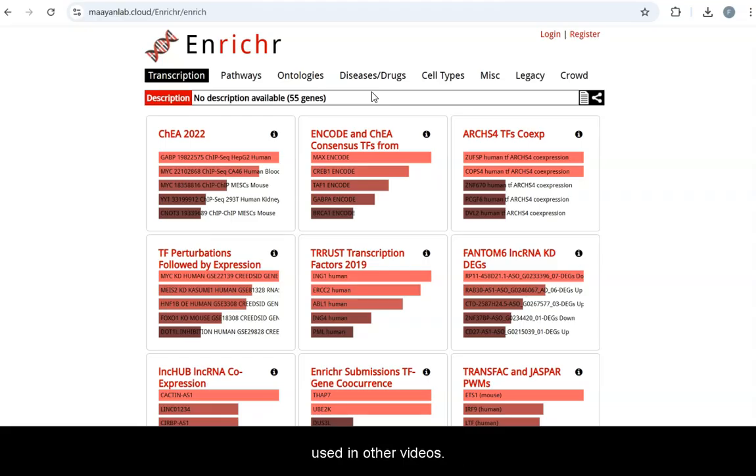these are not the same as I use in other videos, so I'm trying to use a little bit different gene sets, so we see a little bit different data. But that means you can't really compare the hits I get from different softwares or tools here.